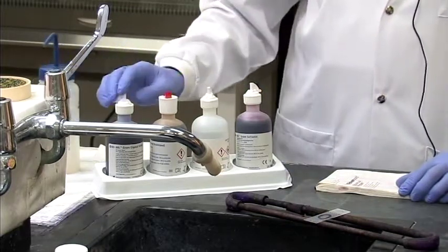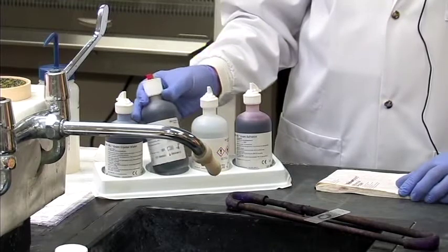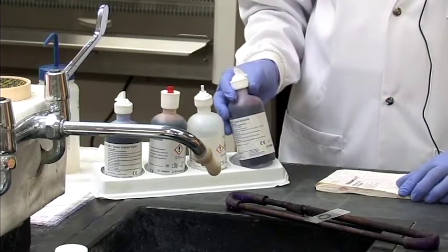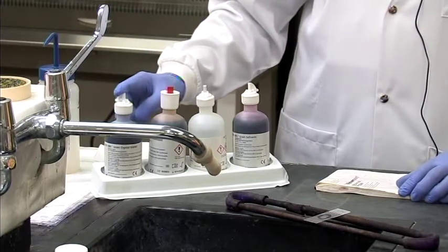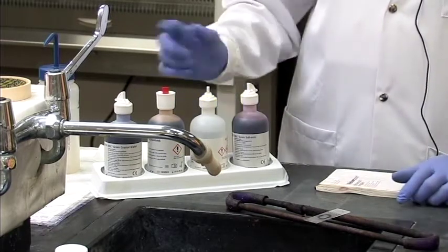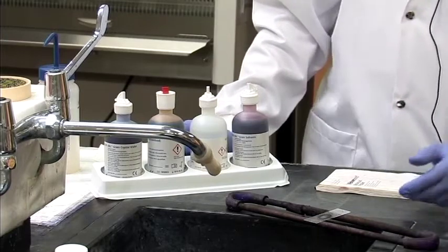The staining procedure will consist of using these 4 reagents. The first one is crystal violet. The second one, iodine. Third one, your decolorizer, which consists of an acetone alcohol mixture. And the fourth one, safranin or carbol fuchsin. The timing normally involves 1 minute of crystal violet, 1 minute of iodine, a few seconds of decolorizer, and 30 seconds of a counterstain. So now we're going to apply the stains to your slide and try to explain the principle of what happens while the gram stain is being done.